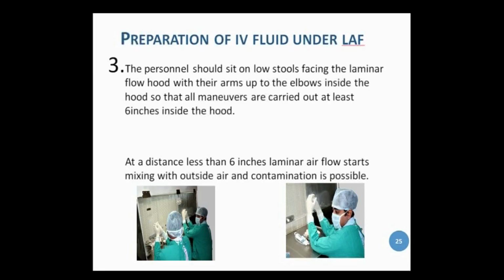For step number 3, the personnel should sit on a low stool facing the laminar airflow hood with their arms up to the elbows inside the hood, so that all the maneuvers they are carrying out are carried out at least 6 inches inside the hood. At a distance less than 6 inches, the laminar airflow starts mixing with the outside air and contamination is possible.